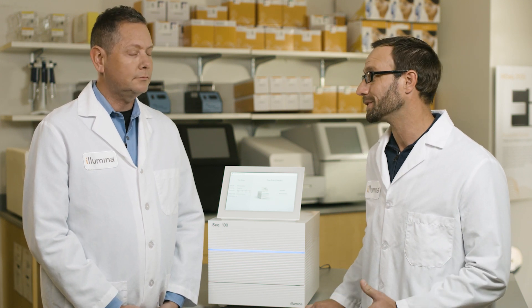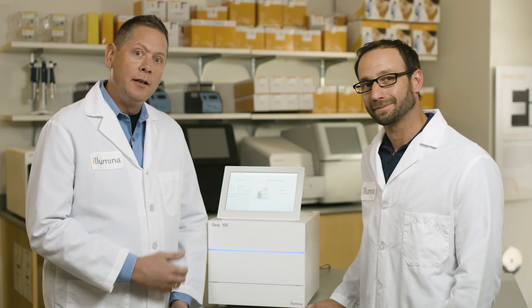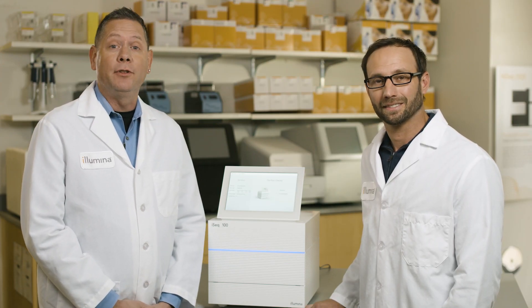You've now seen how easy it is to use the iSeq 100 system from setup to analysis. We're excited here at Illumina to bring a new partner into your lab, the iSeq 100, which makes NGS sequencing more accessible than ever.